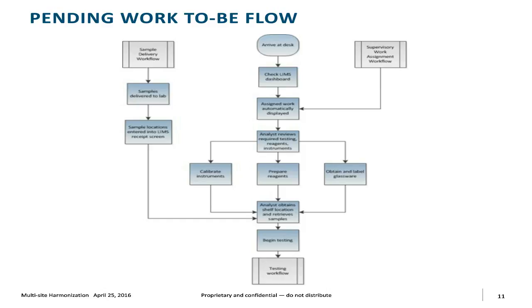So in this case, if you look at the wait state that we had, the second box from the top in the center there, it says check a LIMS dashboard. So we've designed a proposed environment where LIMS will have a dashboard that when I log in, I come in the morning or even the night before, and this is going to be critical in just a moment. I log in the morning, I see how many samples have been assigned to me by my supervisor, and I can see what work there is to be done. That is a push notification. I know of this. I'm not walking by that bin anymore looking for samples. The work is being pushed to me.